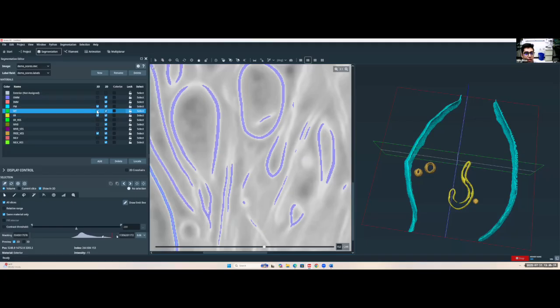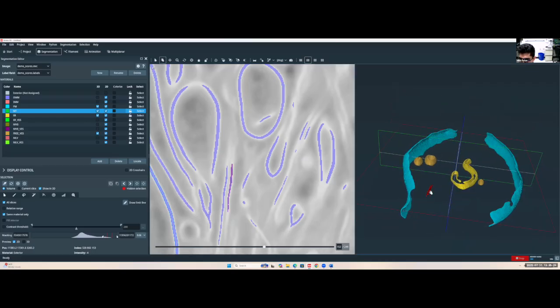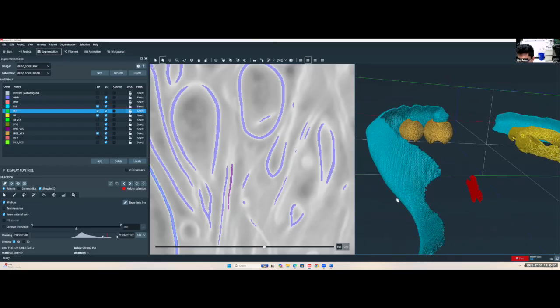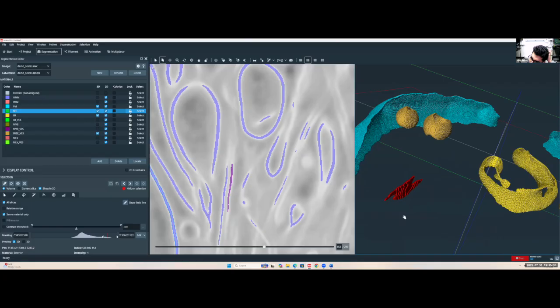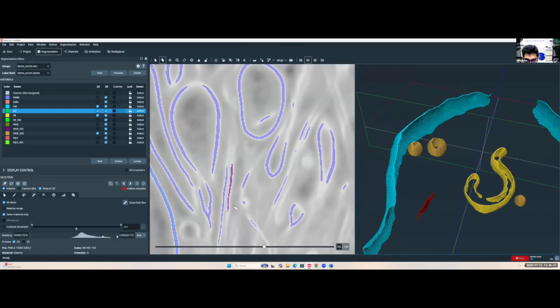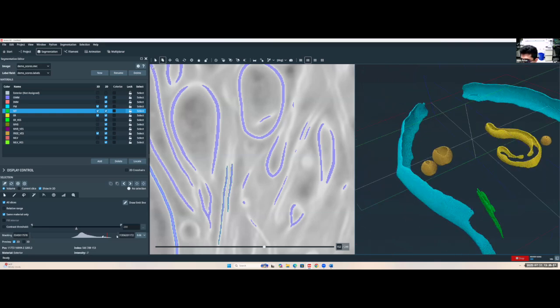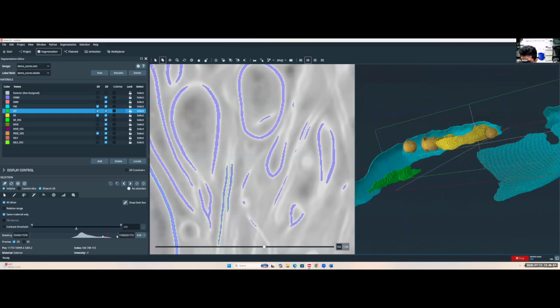The file that we're currently segmenting is membrane, which is designed to segment membranes only. This was also previously explained in the video. If I try to segment this, notice how the microtubule seems to become a membrane. Microtubules are actually filament structures. They are not membranes. So this segmentation of a microtubule actually misrepresents what the microtubule looks like. So you'll see our microtubules don't look like those kind of membrane things.